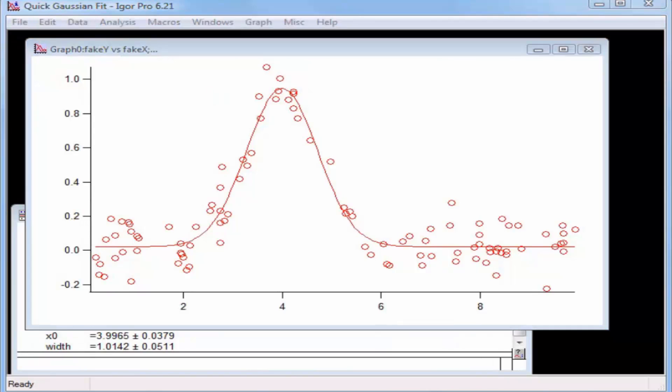The quick fit method is useful for fitting curves when you know that the data conform to one of Igor's predefined models. When you want more options, you can use the curve fitting dialog. I'll demonstrate this in the next tutorial.